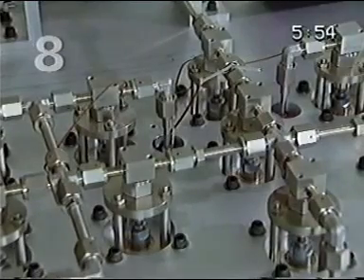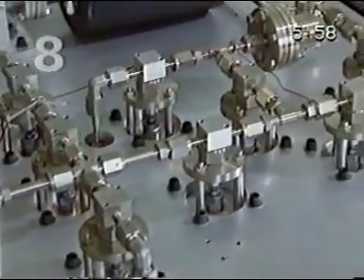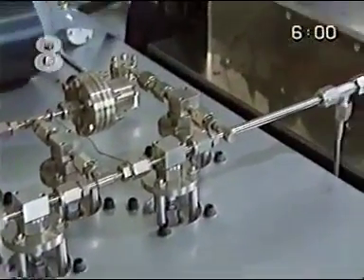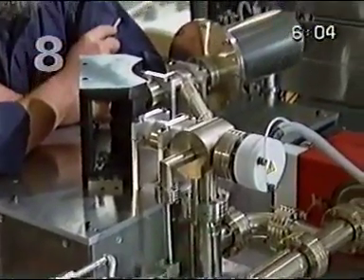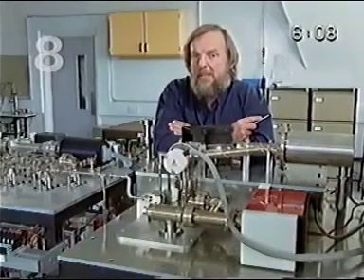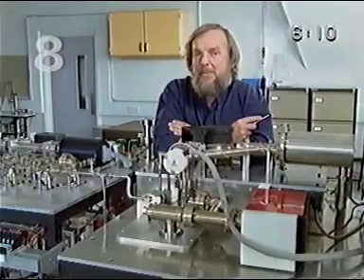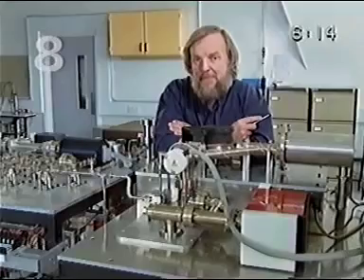To overcome this difficulty, all the vacuum pipework you see here is to enable us to swap backwards and forwards between our sample and an internationally agreed reference material, so that the small differences can be measured and allow us to compare with results obtained elsewhere in the world and even in our own laboratories.